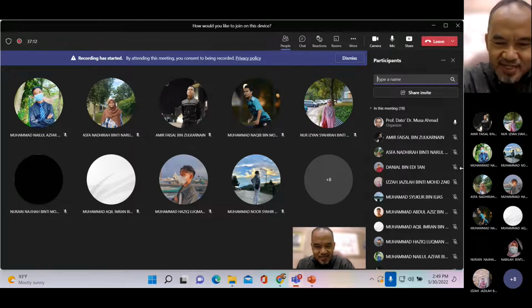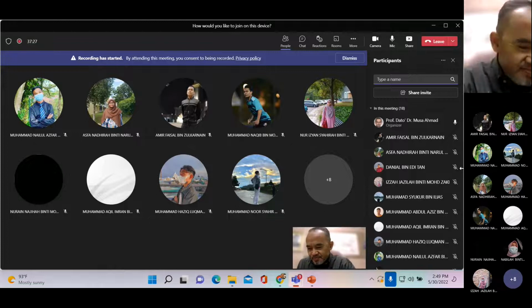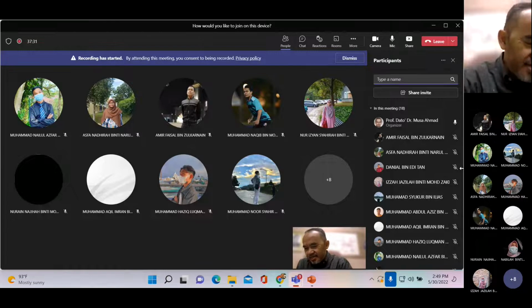That's not quite right. That's okay. Try once again. What makes absorbance more convenient for us to measure compared to transmittance? Okay. Another.